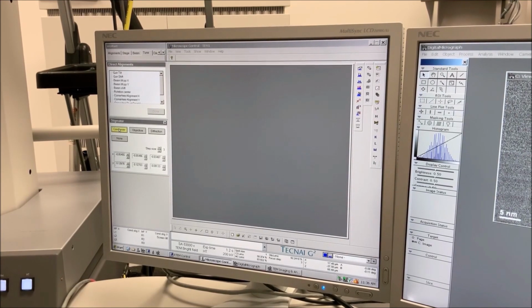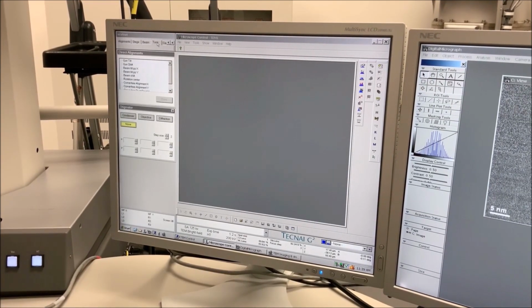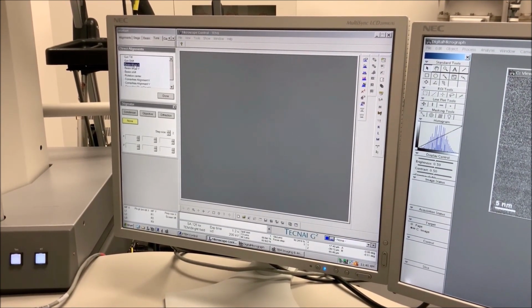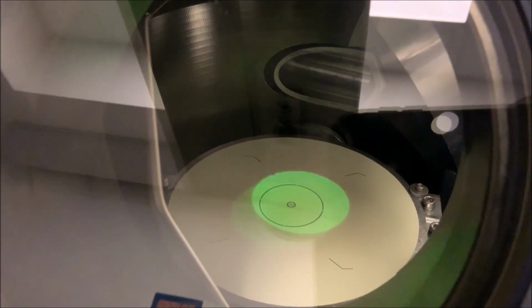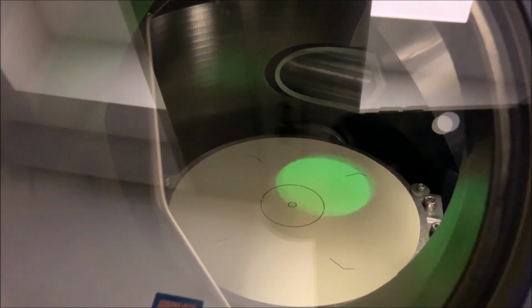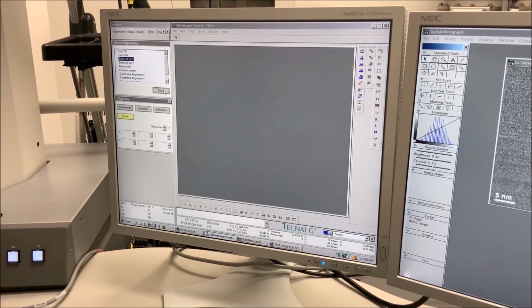To deactivate the condenser stigmators, navigate back to the Tune tab in Microscope Control, then to the Stigmator control panel and select None. To balance the pivot points, navigate to the Tune tab in Microscope Control, then to the Direct Alignments control panel, and then select Beam Tilt PPX. Use the multifunction knobs on the left and right hand control panels to minimize separation of the beam. When finished, return to the Direct Alignments control panel and select Done.